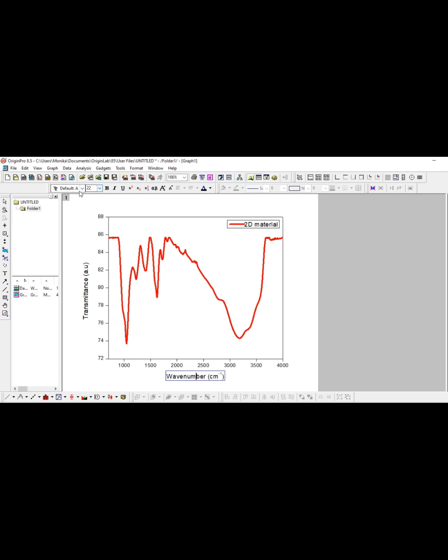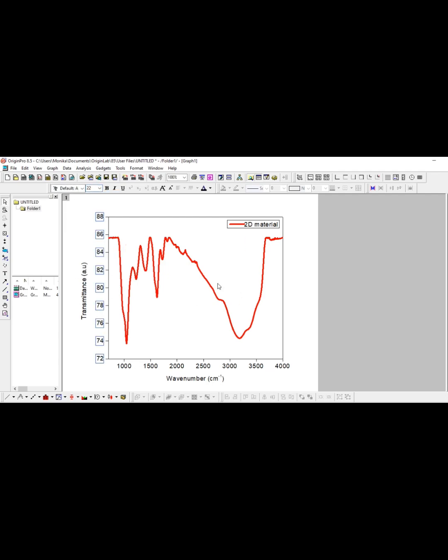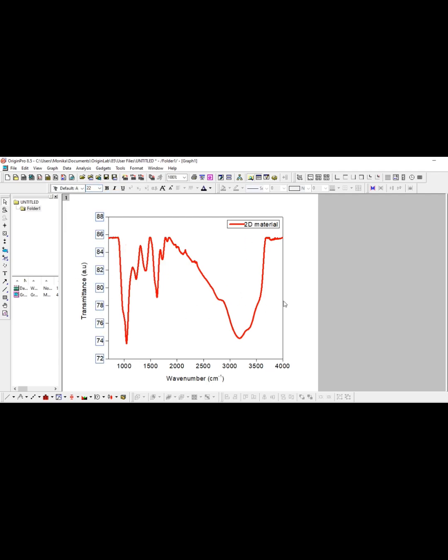You can make it bold, change the style, change the form. Similarly, you can do for here. If you want to change the x-axis scale, you can change like this. It's better to change it because for journals you will send this image in a very small size, so it's better these values will be bigger and everybody can see.